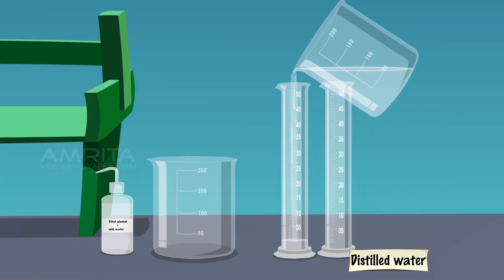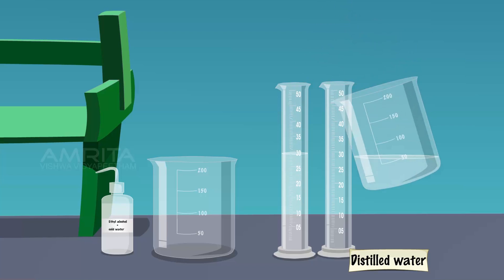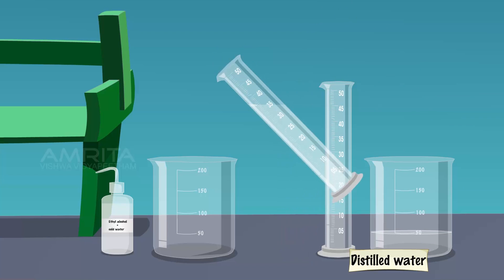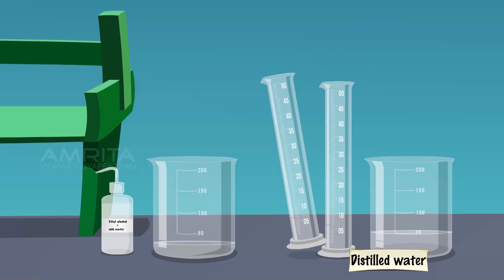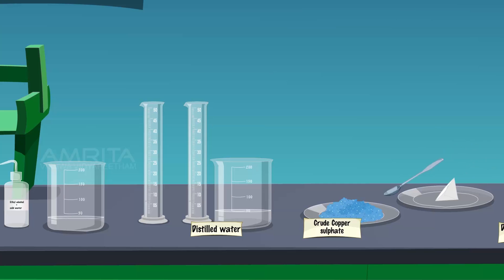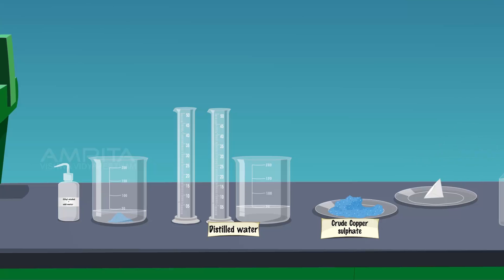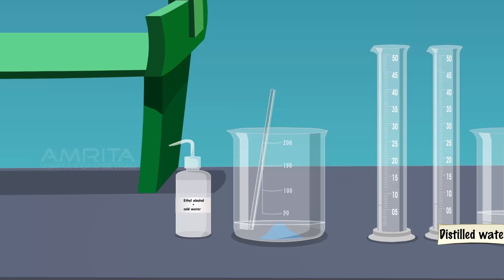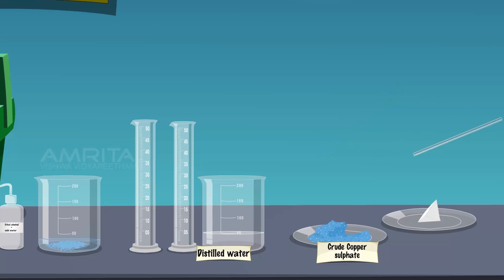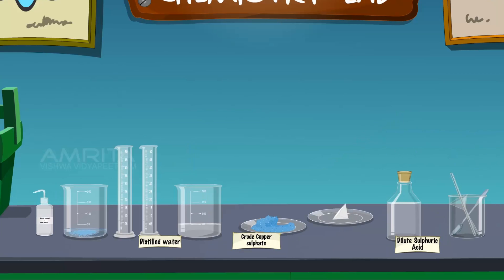Take 30 ml of distilled water in the measuring cylinder and pour it into the clean beaker. Take a small quantity of powdered crude sample of copper sulphate using the spatula. Add copper sulphate into the beaker containing distilled water. Stir the contents of the beaker well using the glass rod to dissolve it. Make several additions of the powdered sample till a little of it remains undissolved even after stirring for some time.